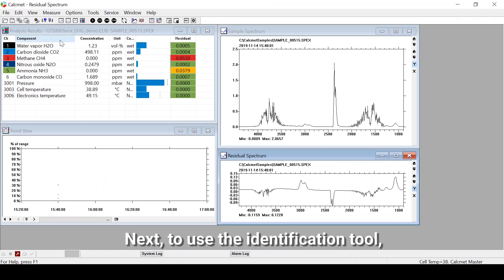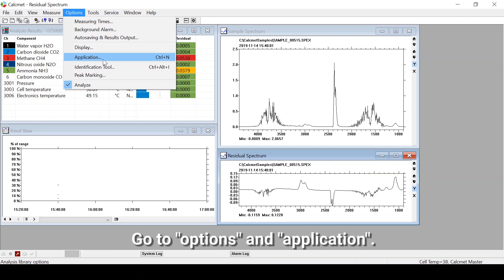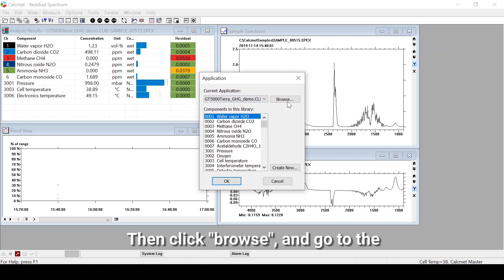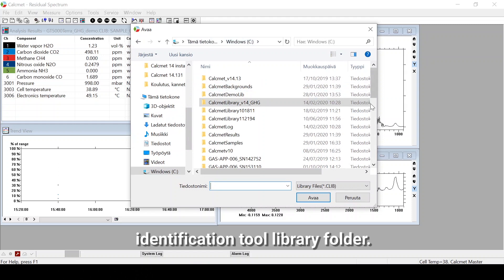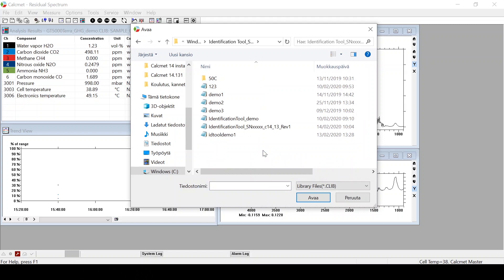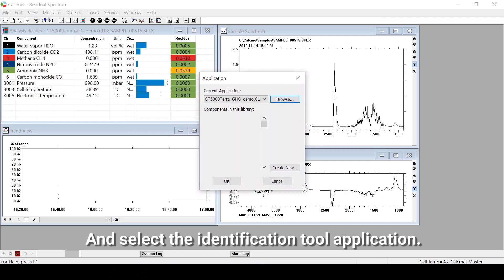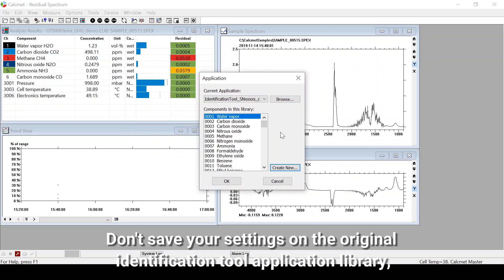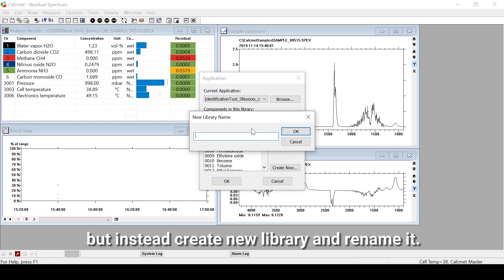To use the identification tool, we will open the identification tool application library. Go to Options and Application, then click Browse, go to the identification tool library folder, and select the identification tool application. Don't save your settings on the original identification tool application library — instead, create a new library and rename it.